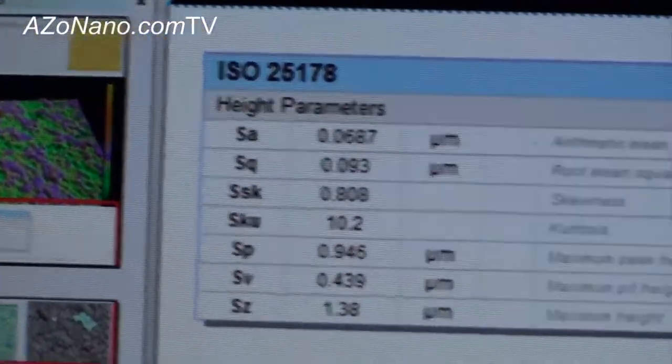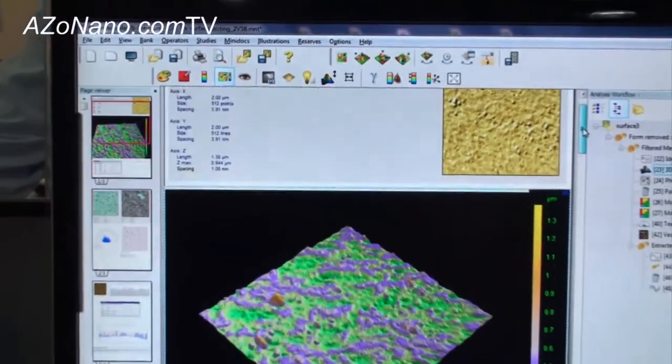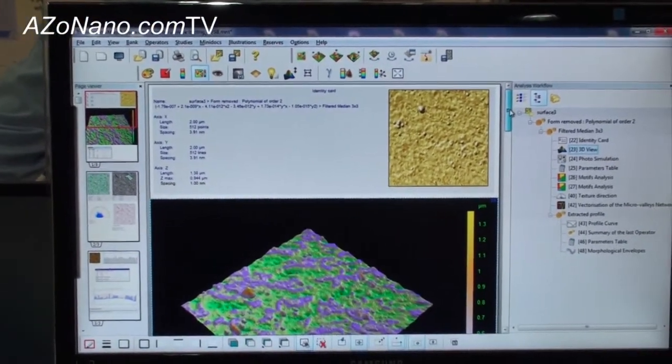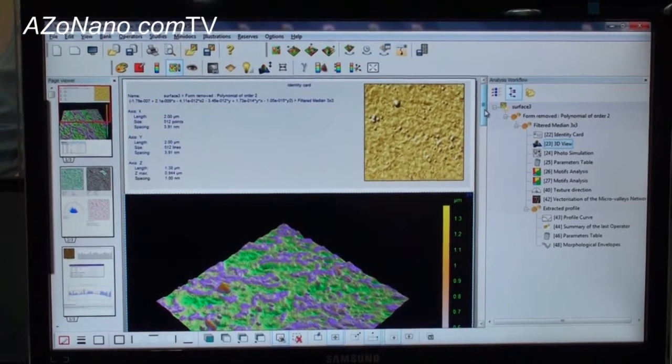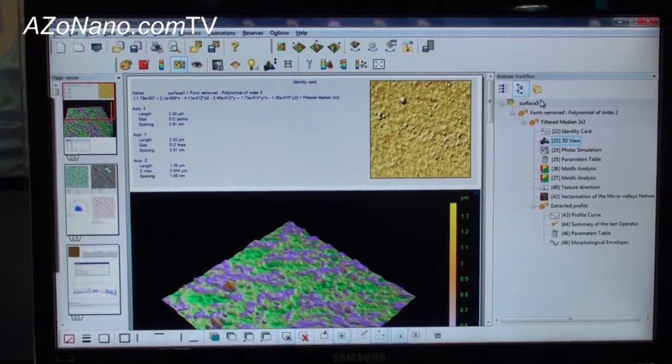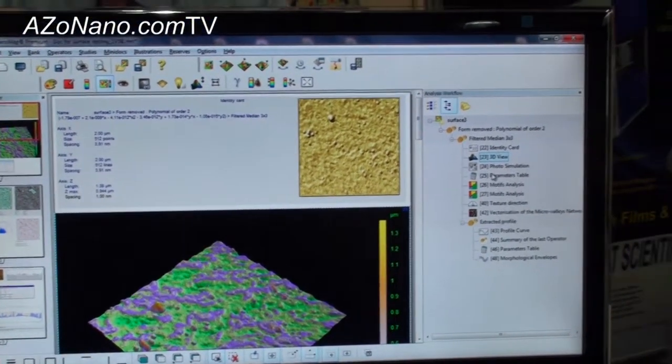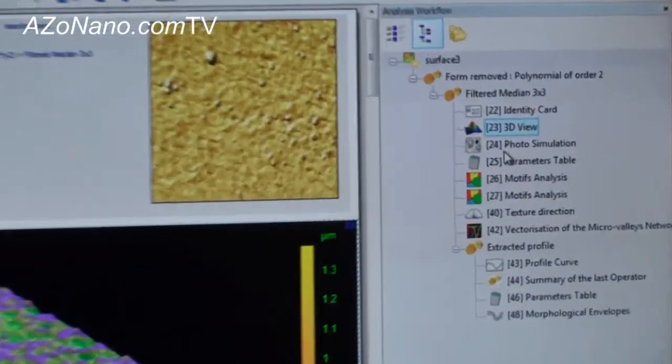In the center, you have the active part of the document in order to work on the application and to highlight some characteristics of the surface. And on the right side of the user interface, you can see the analysis workflow, which is the information contents into the document.